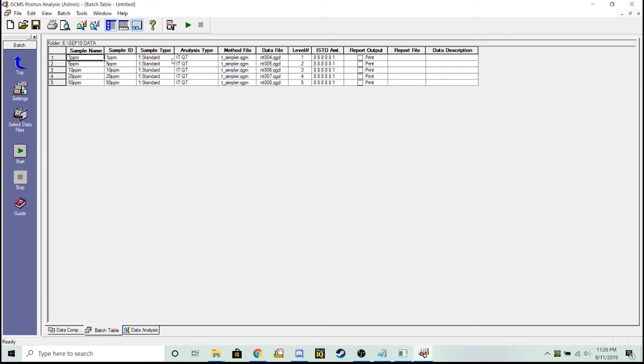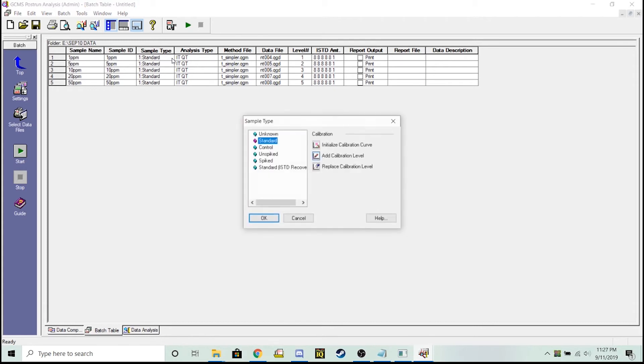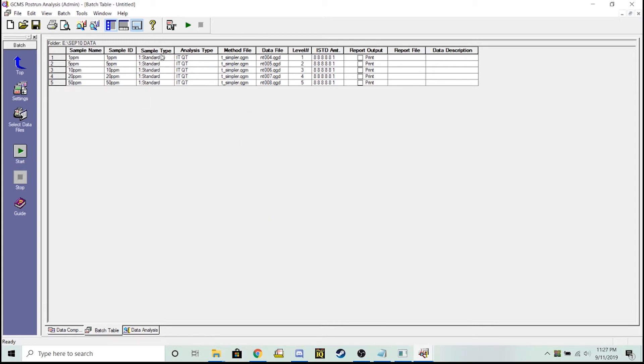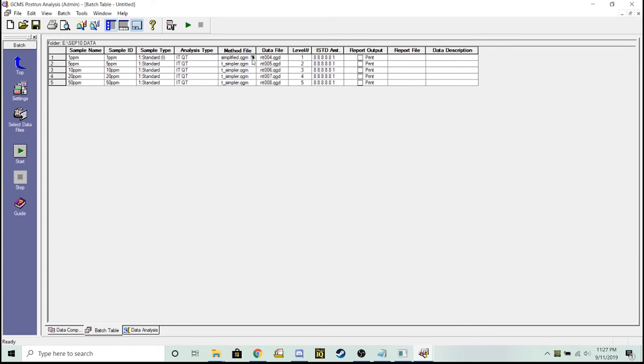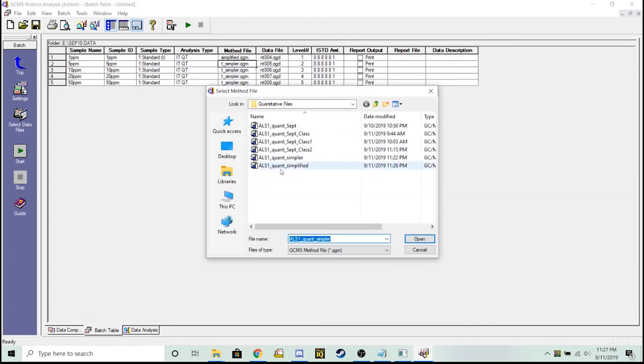We want to initialize the curve at this 1 ppm level, so my sample type standard, this initialized calibration curve - put a little I in parentheses right there. Over here my levels are increasing one, two, three, four, five. My internal standard amounts are eight, but my method is not that simplified method that I just input. So let's use my brand new made method.